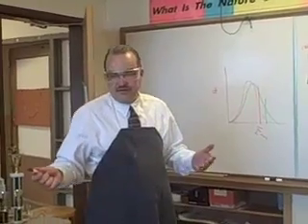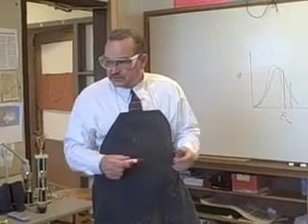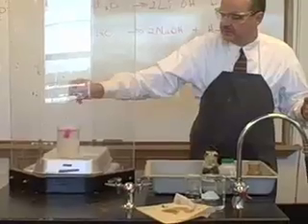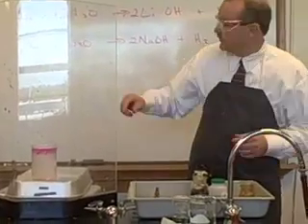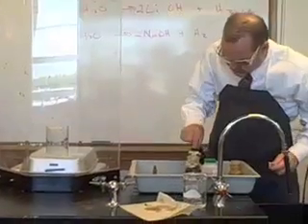Right? So the hydrogen is created fast, so therefore there's enough of it to sustain a fast burn of the hydrogen. And what is an explosion? It's just a fast burn, fast combustion reaction, right? Oh yeah. Very pink again, so we know sodium hydroxide was indeed produced. All right, let me dump this.